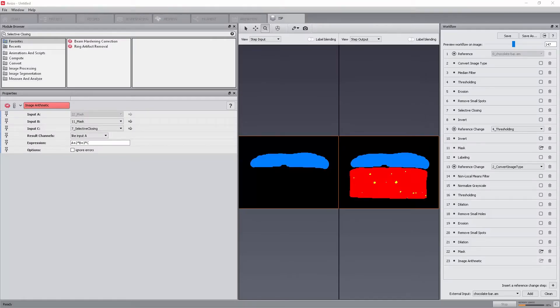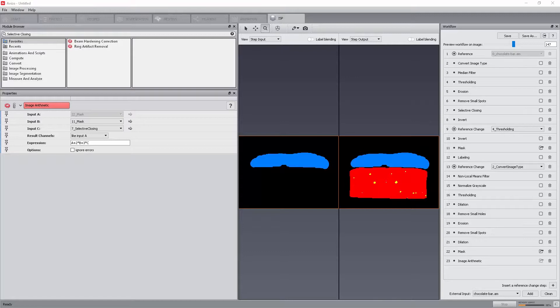We will now add an extra input to the workflow. The default behavior of the image stack processing workroom is to have access only to the data built from the reference data the room was opened with. However, it is possible to add data external to the workflow, under the condition that the data has the same dimension in X, Y, and Z as the input reference data.